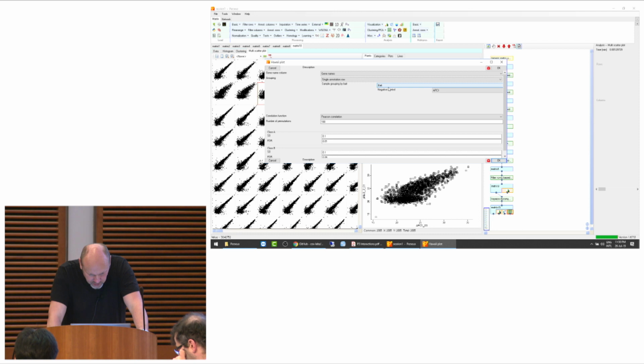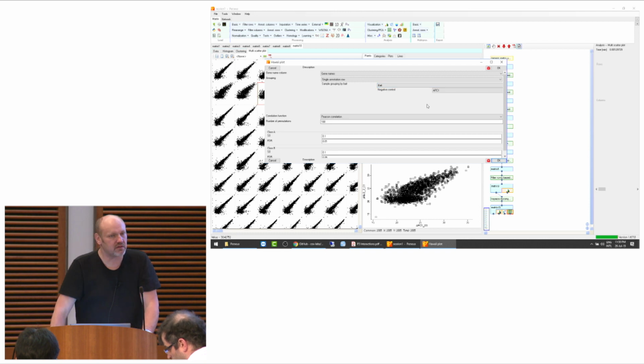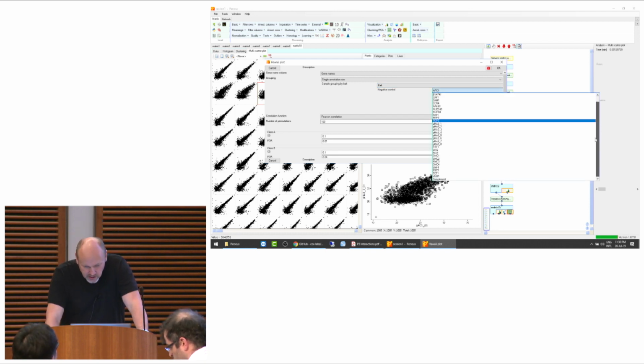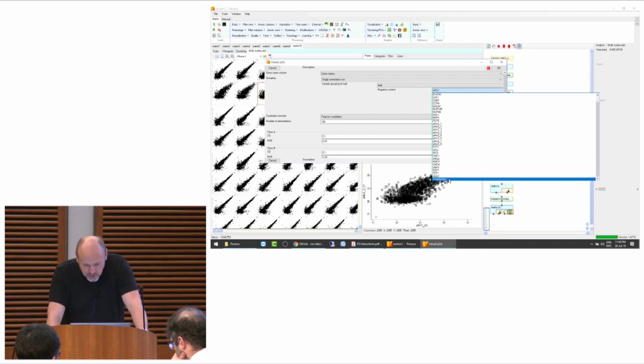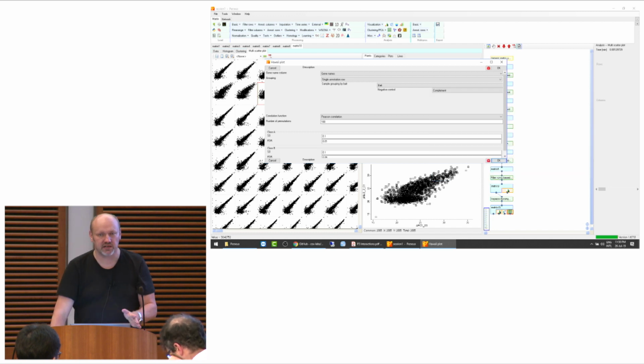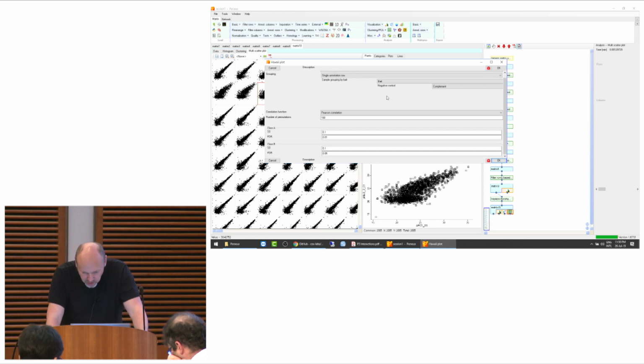And so the sample grouping is by the column that we called bait already, right? So that is actually the bait grouping basically. So we keep that here. And now we have to say what the negative control is. And this is actually, you have to scroll down completely, it's the complement. So it's not a specific group in the data. There's no control group that we want to use, but we use the complement always, right?